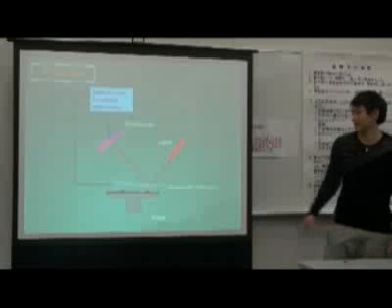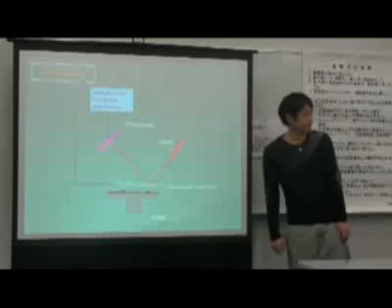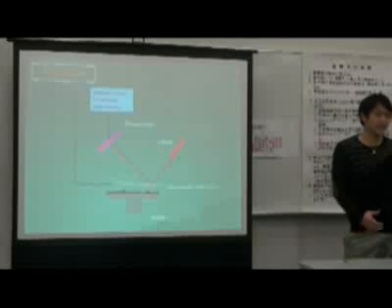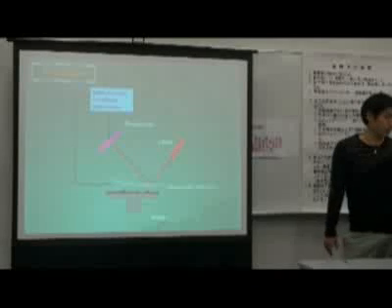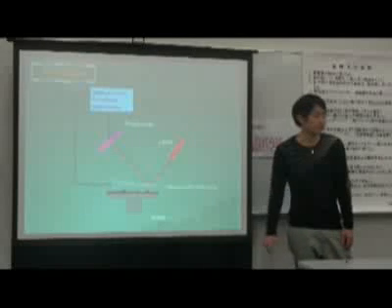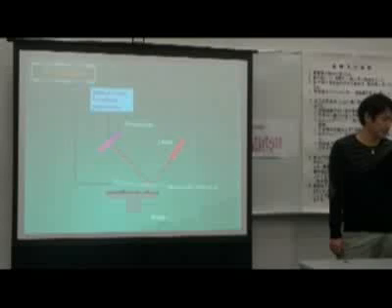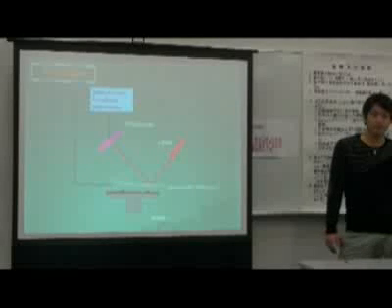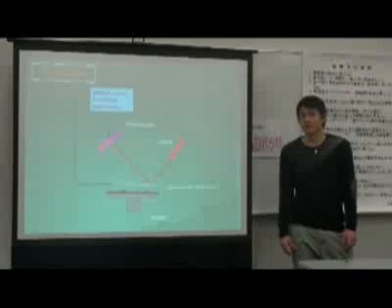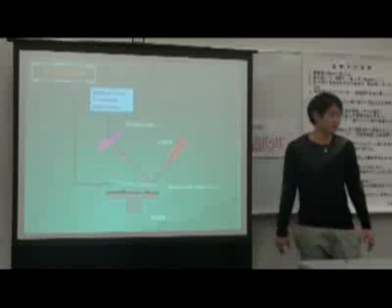This change makes an optical path difference. And then the stage is controlled to reduce this difference along the axis with the scan. This control signal is measured as the surface state of the sample.